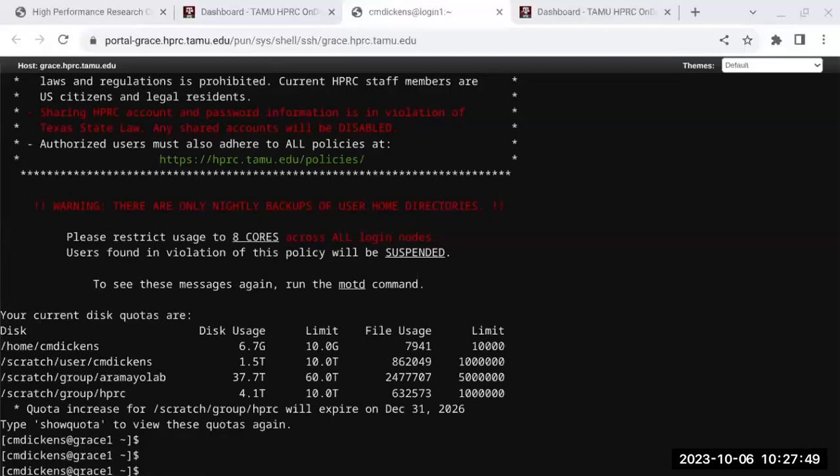I don't know why they put this in the middle. Usually the y-axis is over here, but this is just saying even the short reads have high accuracy. These are probably comparing the Illumina short reads, showing that the HiFi reads can be just as accurate as the short reads, but they have a lot longer length.